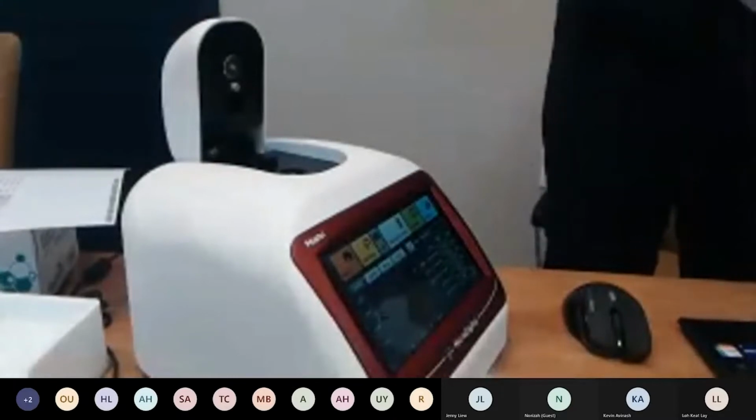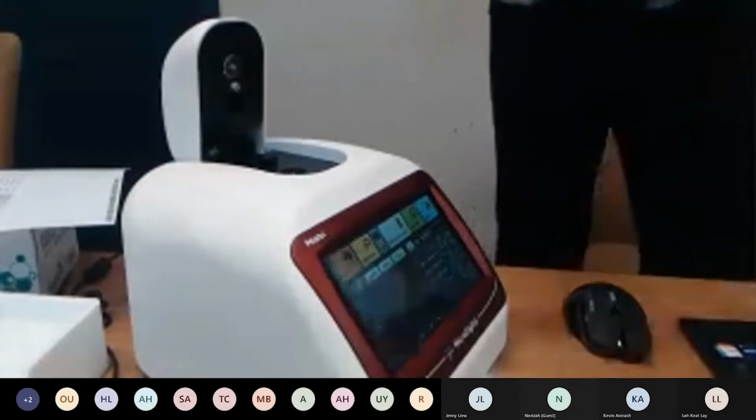Right, with results like this, the best thing to do, not to panic, is just blank again.